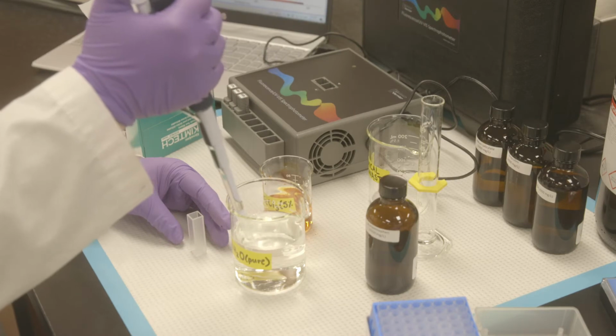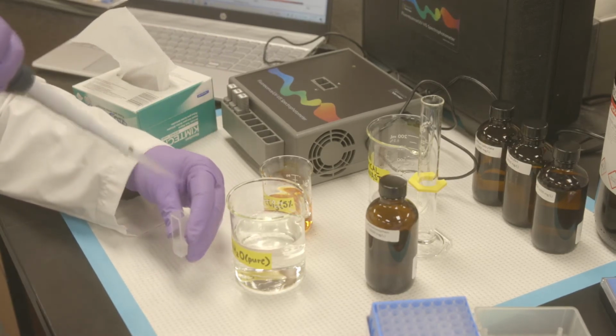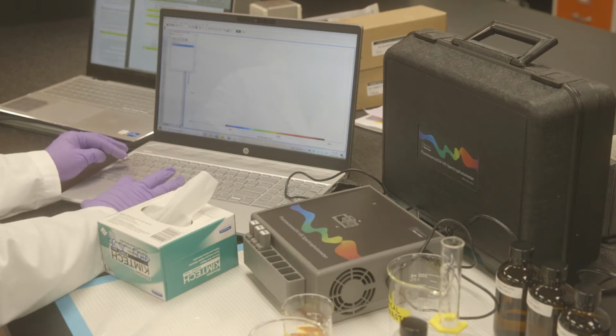As a note, do not overfill the cuvette as it will splash into the instrument. Any excess liquid can be poured into the chemical waste beaker. Follow the dialog box instructions, click Finish Calibration, and then click OK.